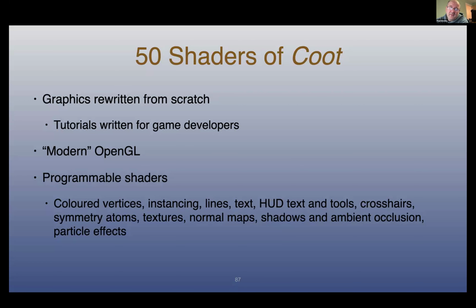And the way one learns graphics, or OpenGL, is to write a game. All the tutorials are written for game authors. There's no reason to learn OpenGL unless you're writing a game. So I went through the tutorials and learned how to provide the infrastructure for writing a game. I didn't know that there were some things that I didn't need to know.